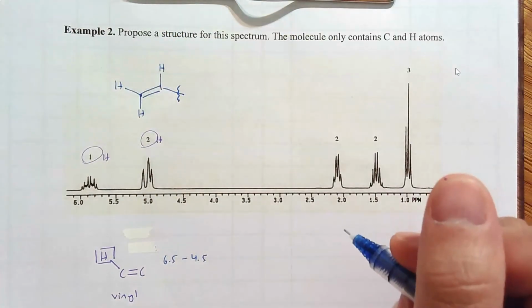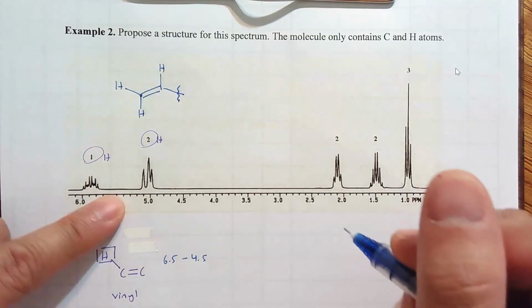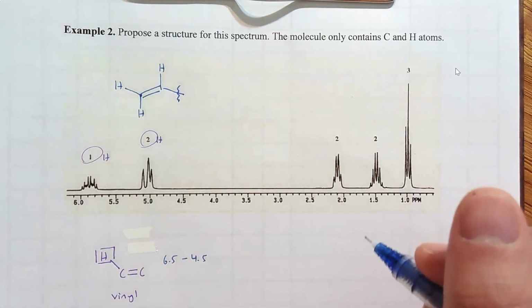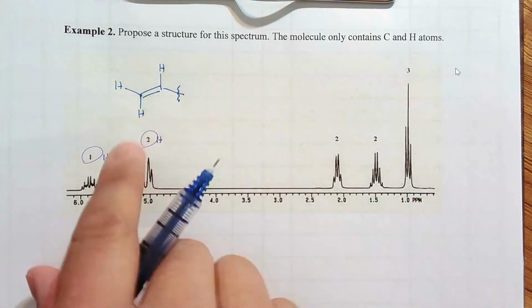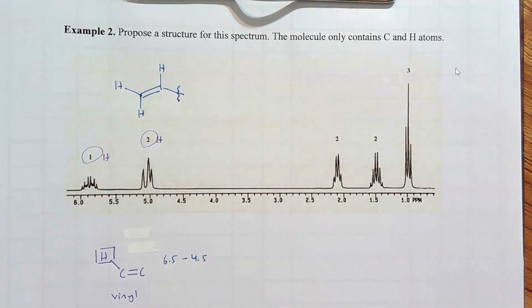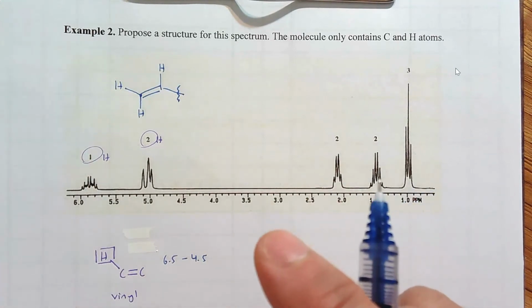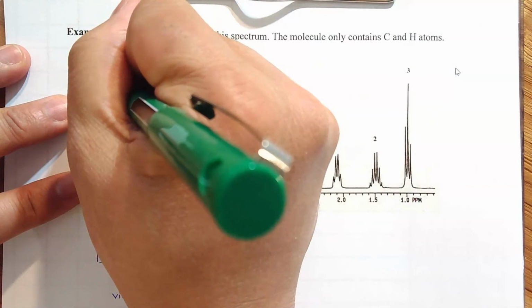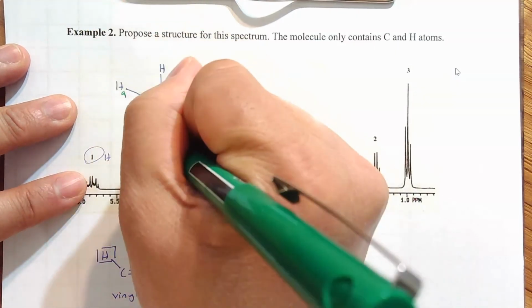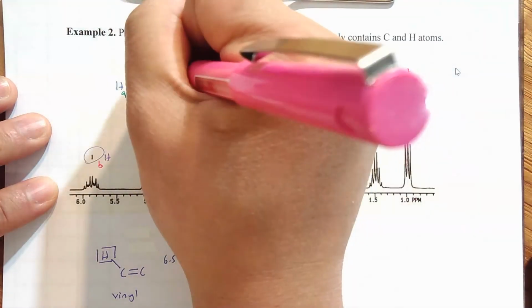You may ask, wait a sec. What's happening with the splitting? Why is it so complicated? Yes, with pi bonds, you could have long-range splitting, and the effect of hydrogens that are far can have an effect. Right now, I'm really dependent on the integral. Okay, and also, I'm going to assume, it's an educated guess, that maybe these 2 are these 2, and then this one lone hydrogen is this one right here.